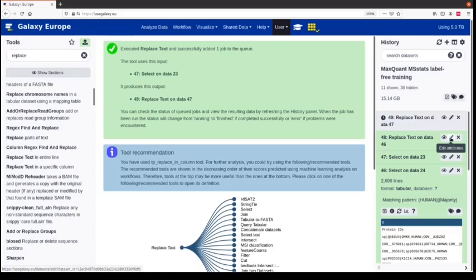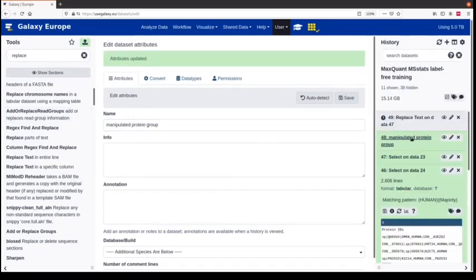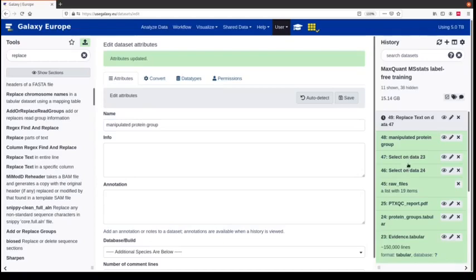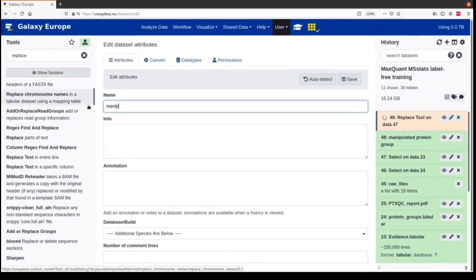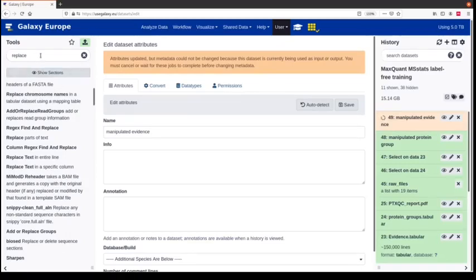We use the rerun button to apply the same replace step to the evidence file. We change the input to the selected evidence file, and the contaminants column in the evidence file is column 54, not column 118. Again, we find the plus and remove it by replacing it with nothing. Now we are ready for the MSStats analysis. You can also rename these files — 'manipulated protein group' and 'manipulated evidence file' — to avoid confusion.